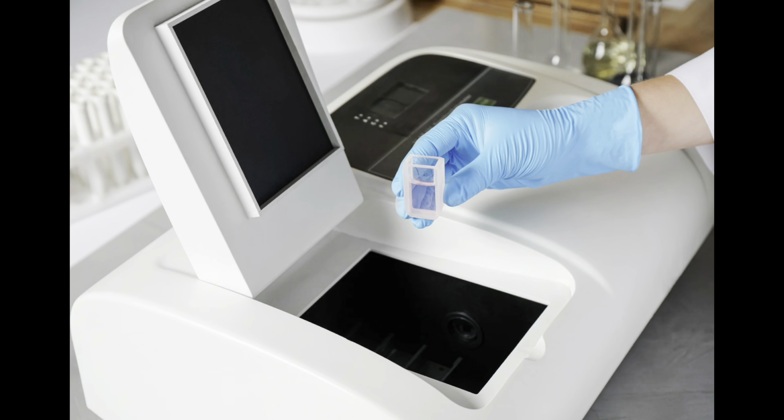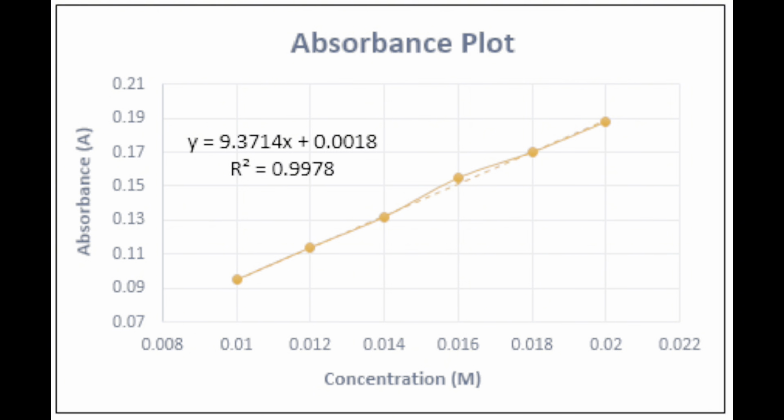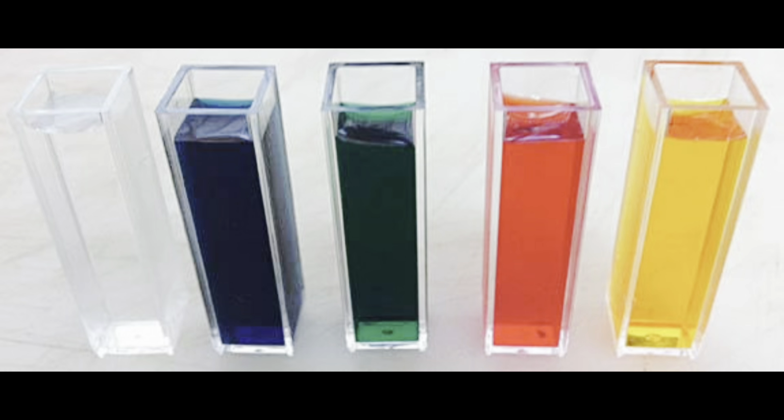Throughout this experiment, you will be using a spectrophotometer to help measure the absorbance and concentrations of the solutions. The spectrophotometer is imperative in measuring across all different wavelengths, which is important for two different situations. Number one, if you are ever using solutions that have different colors or wavelengths, it is important to scan from 800 to 200 nanometers to account for the wide variety of differences.